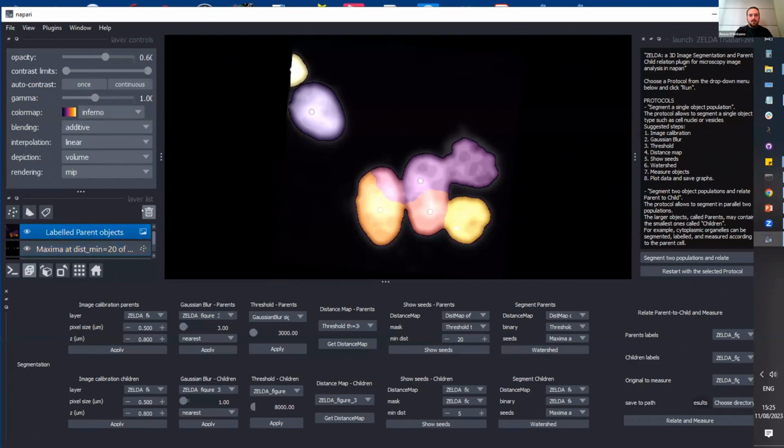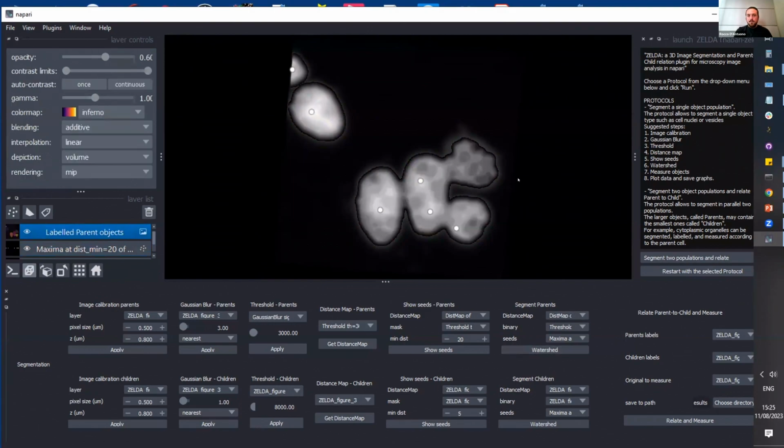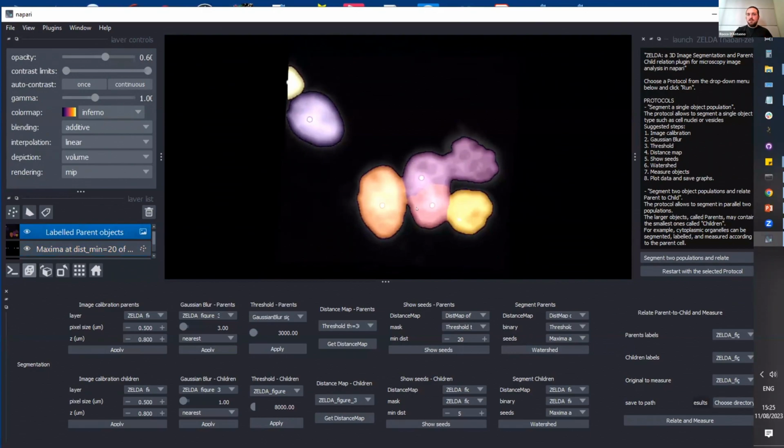Of course, I'll go back here, I'll delete, and I will run again the segmentation now. And now we see that the segmentation improved. So you can do this to graphically correct the results of the watershed algorithm. Again, no single line of code, just graphically do everything.